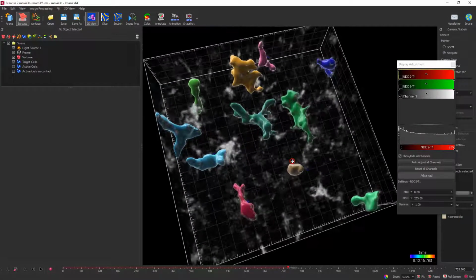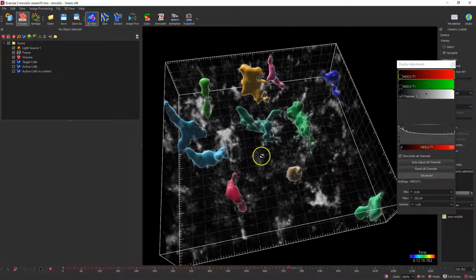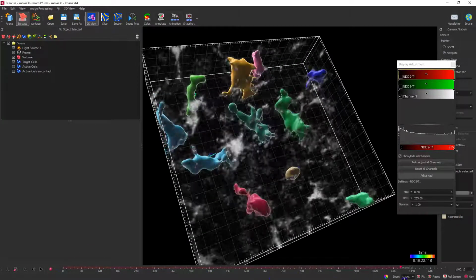And I did the tracking on this, and I can go over this if you have any questions about your data set and you have lots of bleed through. You can just email us support@bitplane.com. We can show you all these different tricks of doing channel arithmetics before your detection, how you detect these cells, how you track them, doing things like that.